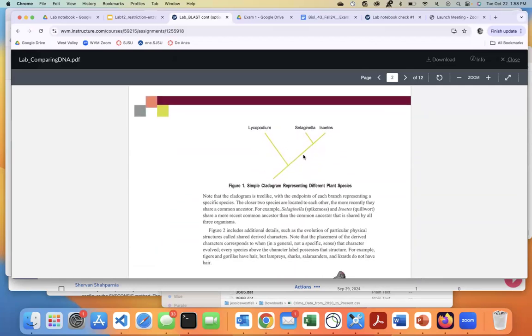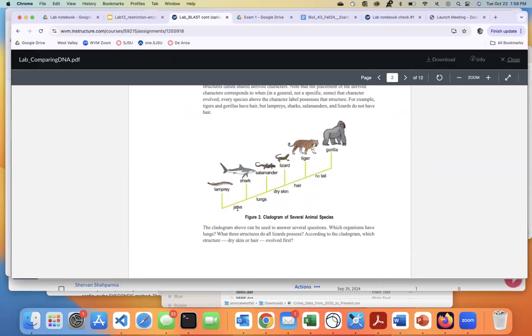I don't know too much about these different species, so I can't speak more than that. But by looking at this, I can tell you which species is close to one another, right? So evolutionary wise, we use DNA sequence a lot of the time, which is what we're looking at today, to tell how close things are from one another. We can actually use it to figure out when certain things evolved. So here in this picture, by mapping the sequences and how close they are evolutionary wise, I can tell you that the jaws was probably developed first, right?